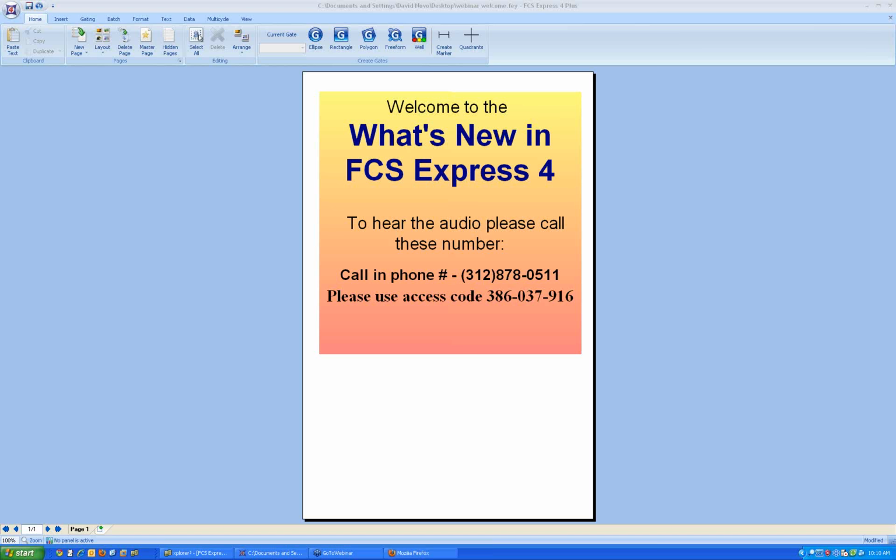The webinar will be about an hour, and I'm going to really just give the highlights of some of the new features in FCS Express 4. I'm really not going to be able to get into much detail in any of them. The idea of this webinar is just so that you know that they're there, you can see what we did, and so you could potentially use it or look up how to do it afterwards. Everything that I show here, we are going to have tutorials on in the future.